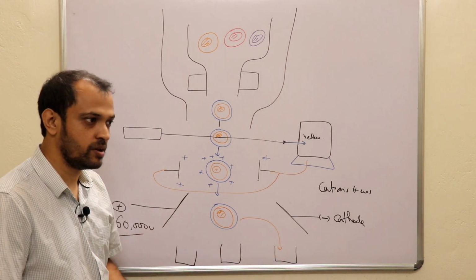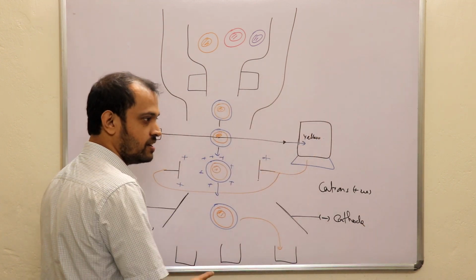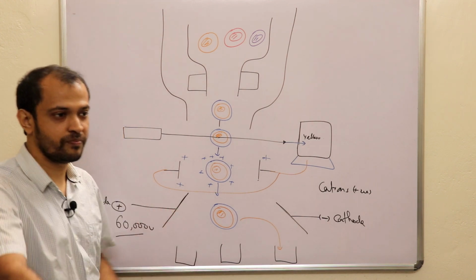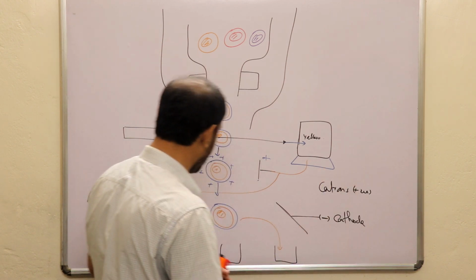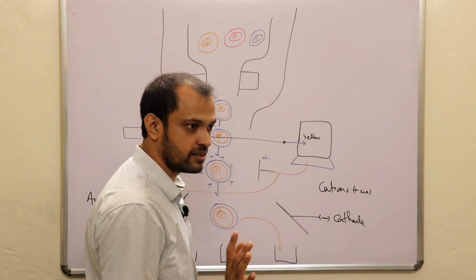Clear? Now listen, we have already told this system that yellow cells should be positively charged. That was our only motto. We have only given this data to the computer, that yellow cells should have positive charge in their droplet.